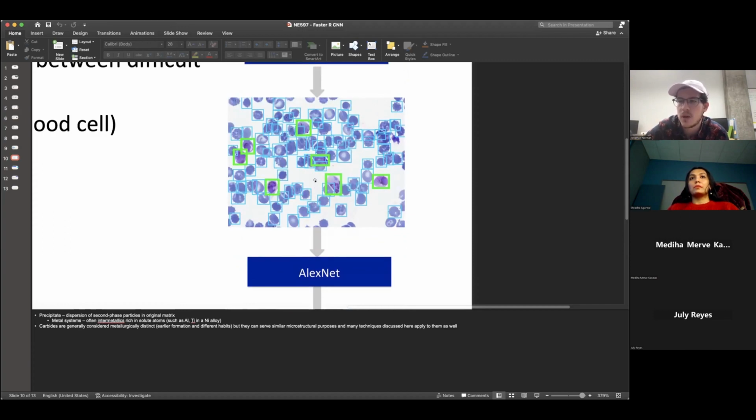And when you're analyzing bubbles, it really is a binary: is this a bubble or is this not a bubble? So if we're treating it analogously, I think just applying faster RCNN for bubble identification would be more than sufficient, because it's very good at that. Yeah, so you would directly apply, right? Absolutely, yeah.